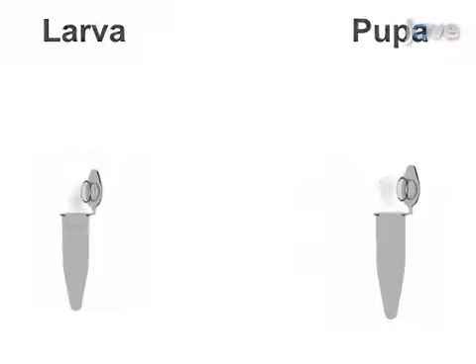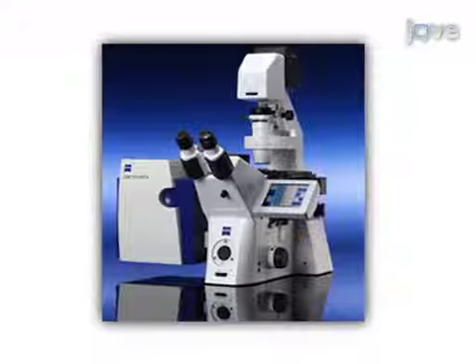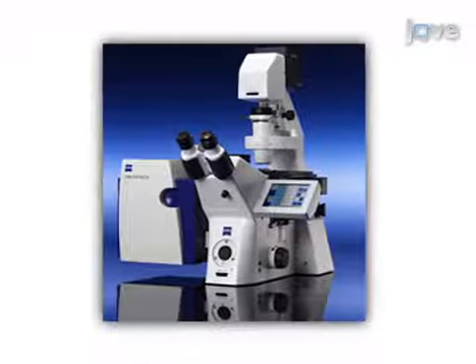After dissection of the larvae or pupae, they are fixed for immunostaining. Next, the fixed larvae or pupae are immunostained with the appropriate antibodies.